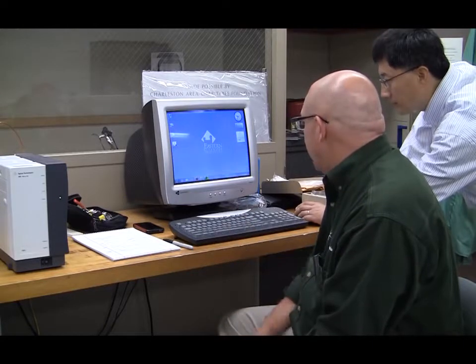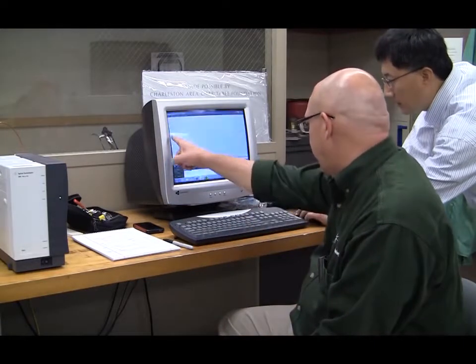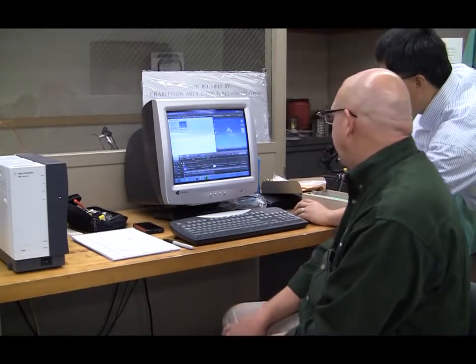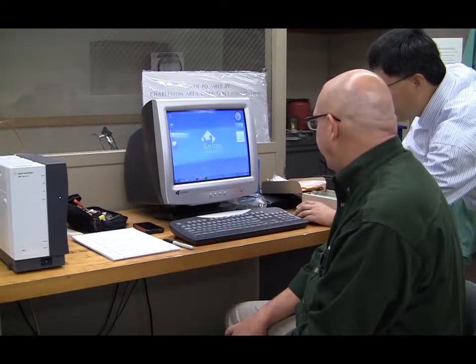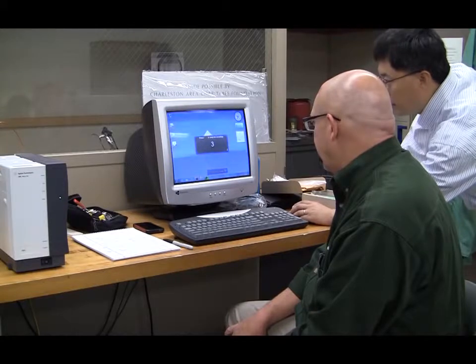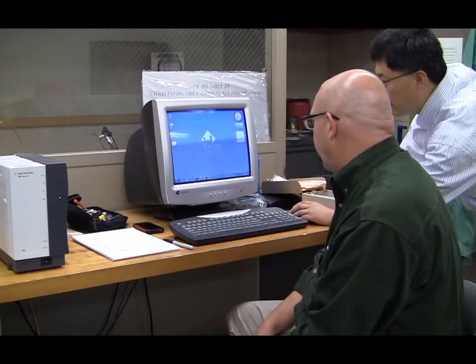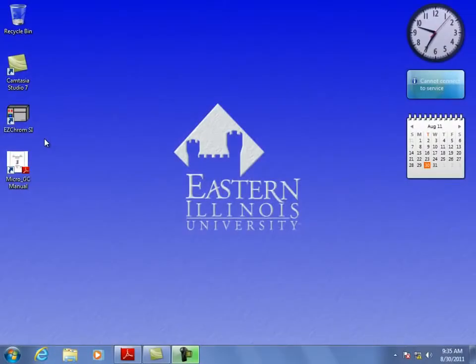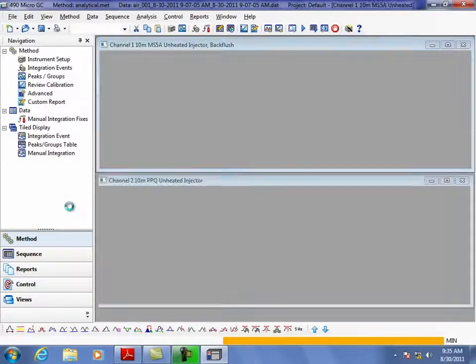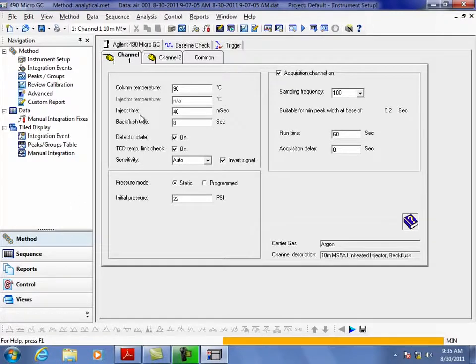Let me see if I can talk to this guy again. Click that one. Right, EasyChrom software. I think it's going to tell me I've got to double click it. Should be opening. It's flushing again, of course, because I just told it to.